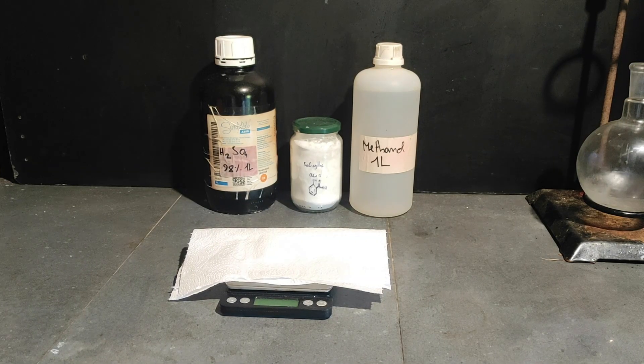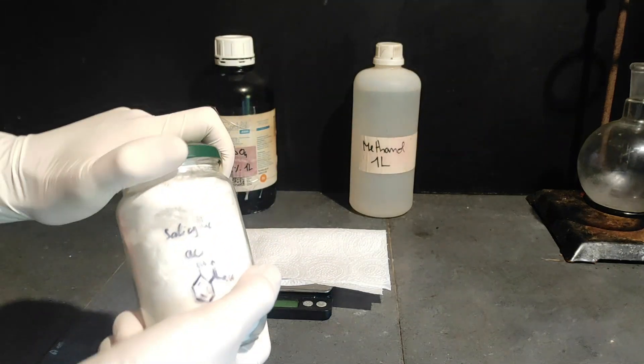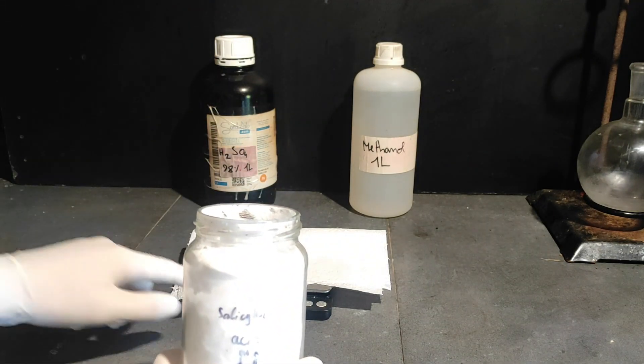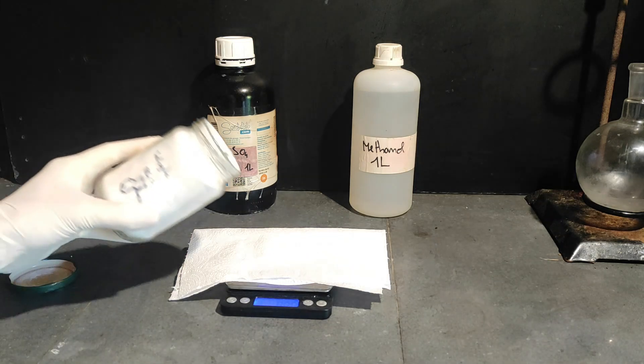For the synthesis, we will need those chemicals displayed here. I start by measuring approximately 15 grams of salicylic acid. If you don't have it as a nice powder like me, you can always make it from aspirin with only one step.